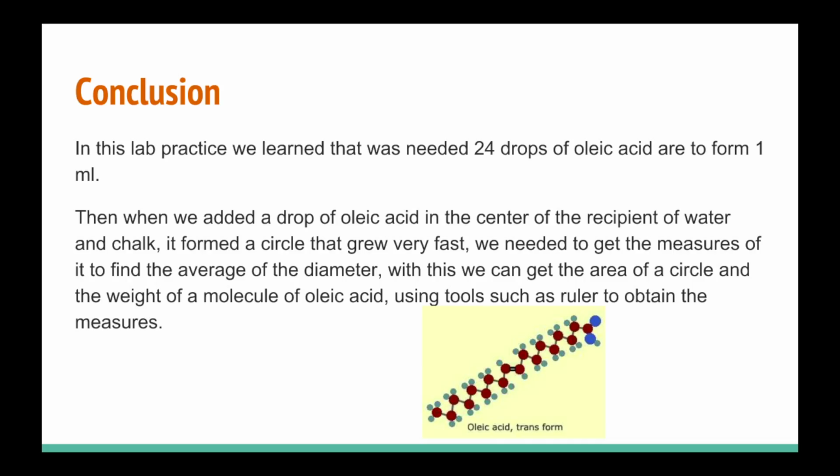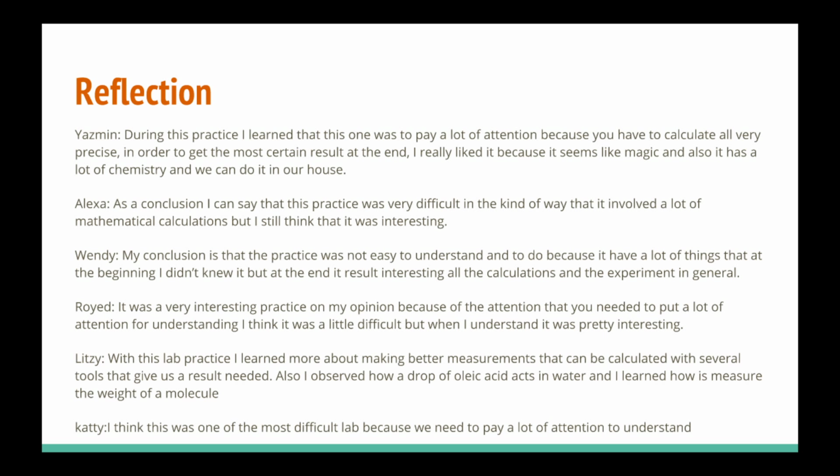With this lab practice, I learned more about making better measurements that can be calculated with several tools that give us a result needed. Also, I observed how a drop of oleic acid acts in water, and I learned how the weight of a molecule is measured. During this practice, I learned that you have to pay a lot of attention because you have to calculate everything very precisely in order to get the most certain result at the end. I really liked it because it seems like magic, it also has a lot of chemistry, and we can do it in our house.